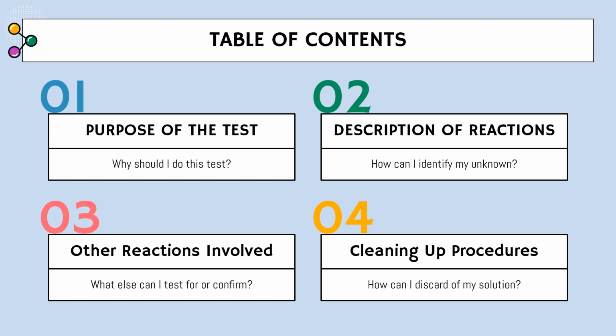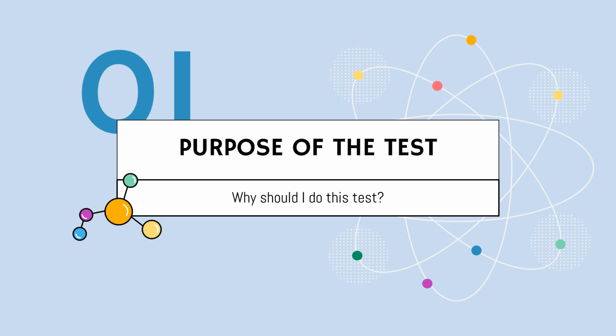In this video, I will be discussing the purpose of the test, why I should do this test, a description of the reactions, how I can identify my unknown, other reactions involved, what I can test for or confirm, and cleaning up procedures, how I can discard of my solution. First, I will be discussing the purpose of the test.